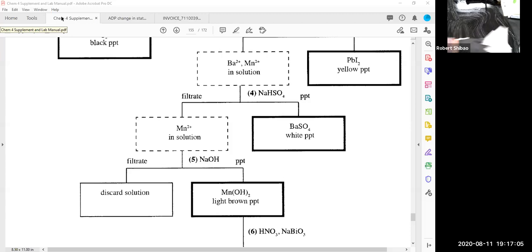You don't know how well people clean the counters up. So normally, when I was taking lab, I would always clean the counters before I started an experiment, in case the previous person using the lab bench spilled something but didn't really clean it. That often happens. So it's good lab practice just to clean the counter before. That way, if you spill something, you could still possibly recover it. Unfortunately, what we spilled was a solution, so it would have been very difficult to recover that.